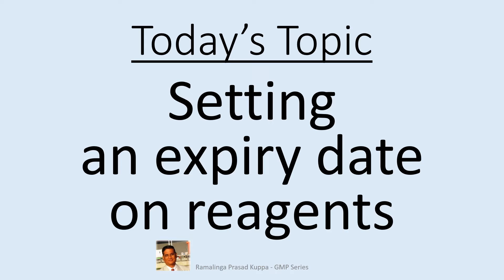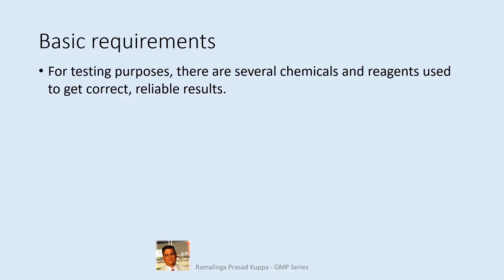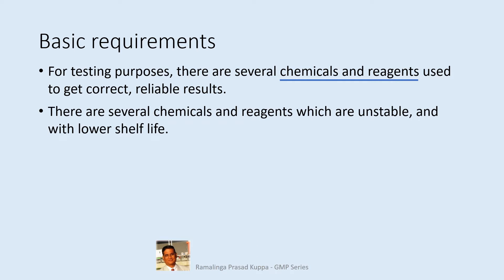This is an entirely different subject compared with the stability studies conducted for establishing the shelf life or expiry of APIs and drug products. For testing purposes, there are several chemicals and reagents used to get correct and reliable results. For each step of chemical analysis, a specific reagent is required, and there may be more than one reagent or chemical used for a particular analysis. There are several chemicals and reagents which are unstable and with lower shelf life. The stability or usability of reagents is not the same always.